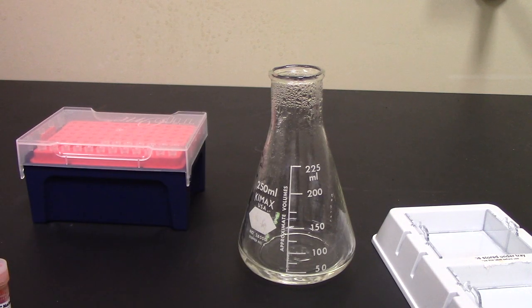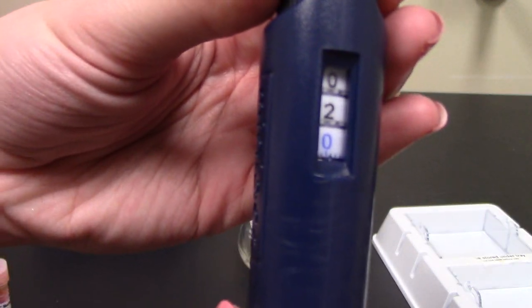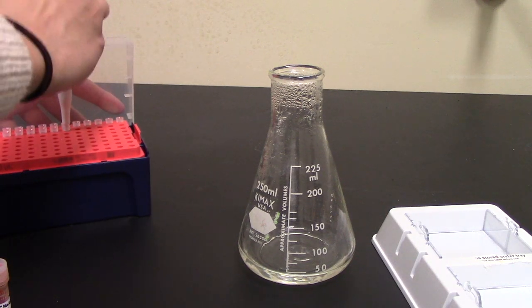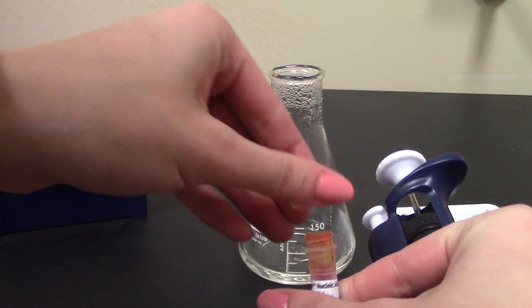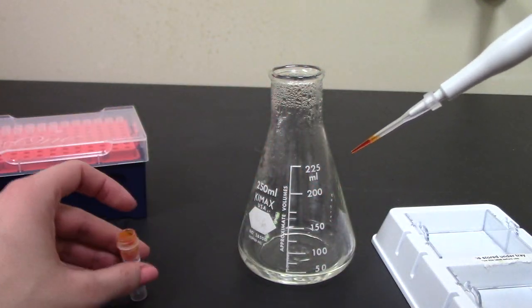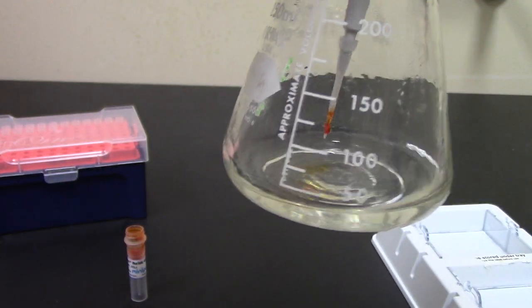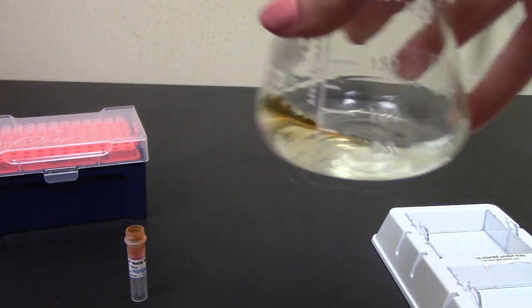I'm just going to set my pipette to 2 microliters, get my pipette tip, open up the stain, and pipette up 2 microliters and add it into my gel and swirl it around.